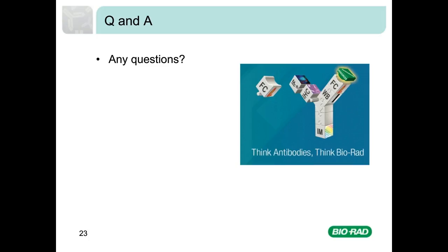Both have different benefits. Beads are ideal if you have a limited sample, so you can use all the cells in the experiment. If you have a low abundant antigen, then using beads would be advantageous to get a larger positive population. The problem with beads, however, is you can't use these for dyes, so in this case, you'll have to use cells for things like live dead staining. But as long as the positive and negative populations are the same for each control, you can actually use a mixture of both beads and cells for your compensation panel.